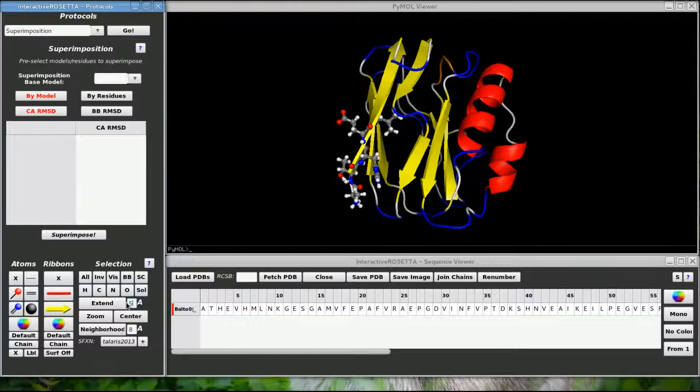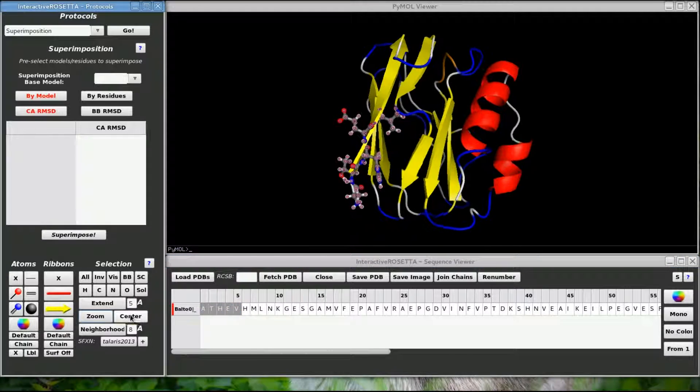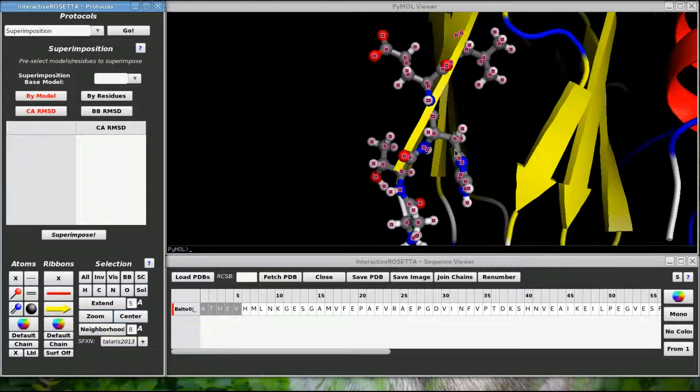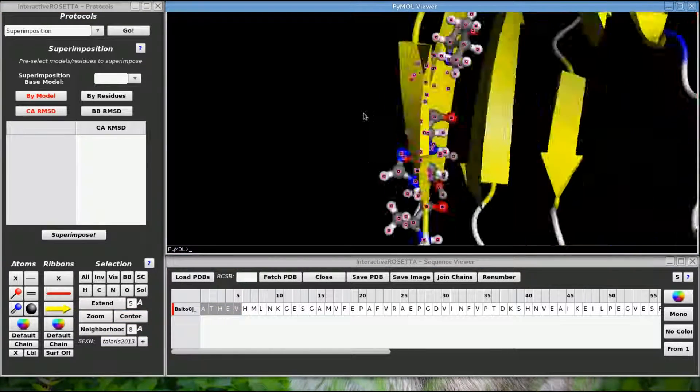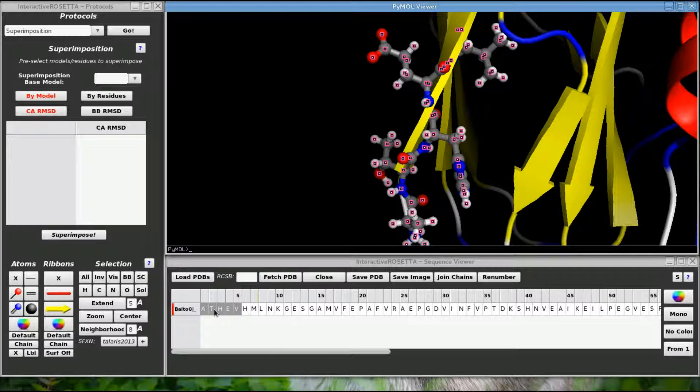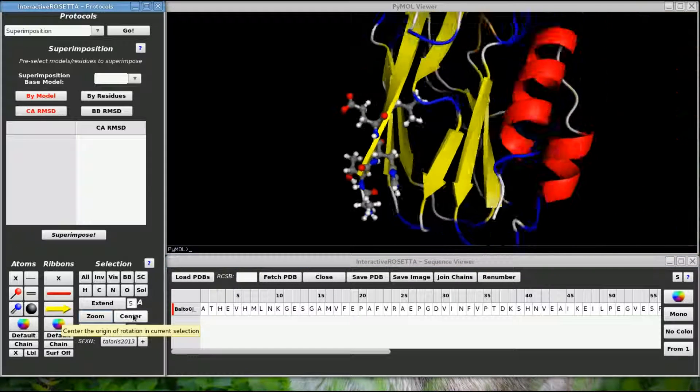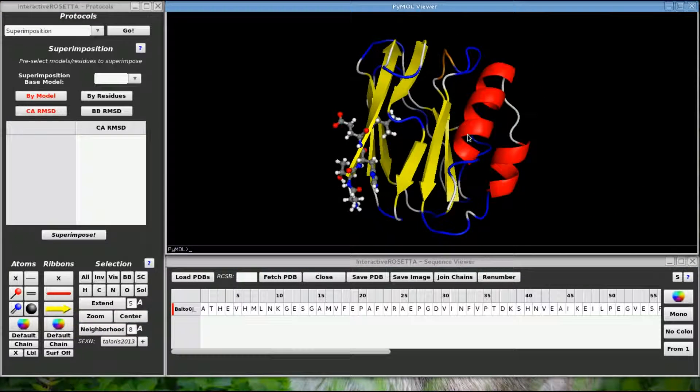Zoom will zoom in on the current selection. Center will place the Pymol center of rotation at the center of mass of the current selection. Let's unselect everything and zoom back out and re-center the molecule.